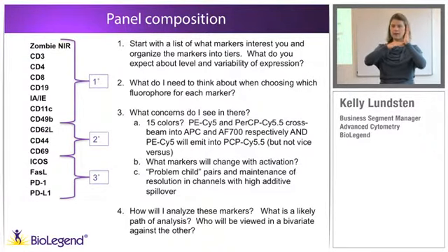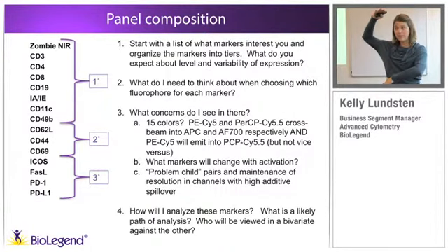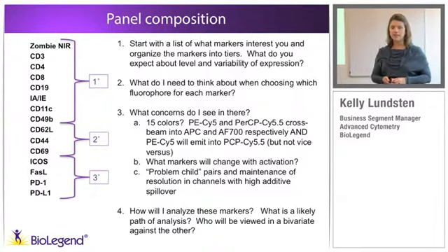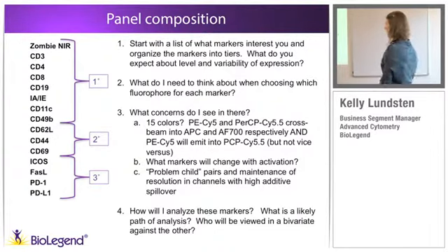And that's because of an artifact called spreading error. Spreading error is a photon miscounting error: the brighter the marker gets, the wider the distribution of the MFI positive gets, and the harder it is to have a clear delineation of the MFI positive and negative that's double positive. So I'm going to show you an example of that. It's a relatively complex quandary in the field right now.